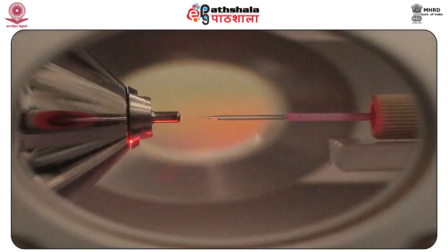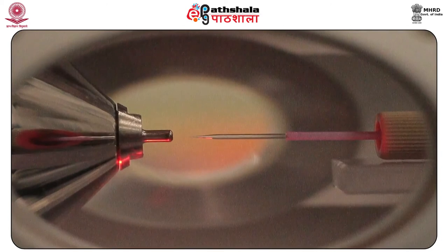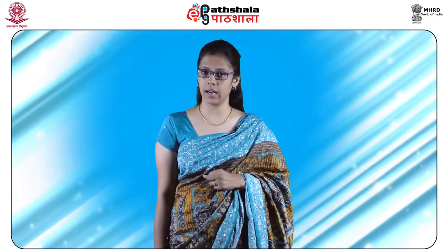Now next is capillary electrophoresis. Capillary electrophoresis is a family of electrokinetic separation methods performed in sub-millimeter capillaries and in micro and nanofluidic channels. Very often, capillary electrophoresis refers to capillary zone electrophoresis, that is also called CZE. But other electrophoretic techniques, including capillary gel electrophoresis, that is CGE, capillary isoelectric focusing, that is CIEF, capillary isotachophoresis, and micellar electrokinetic chromatography, that is also called MEKC, also belong to this class of methods.